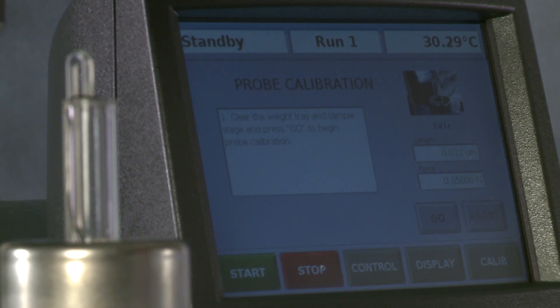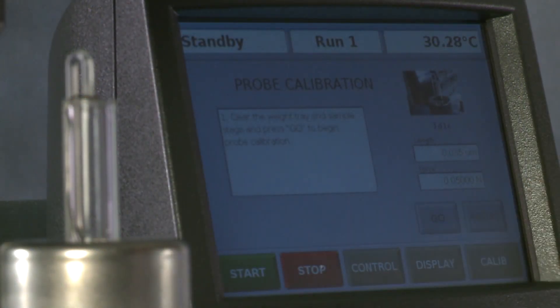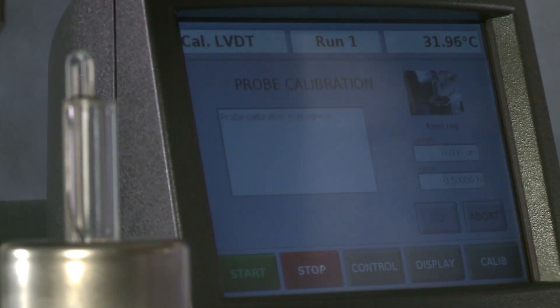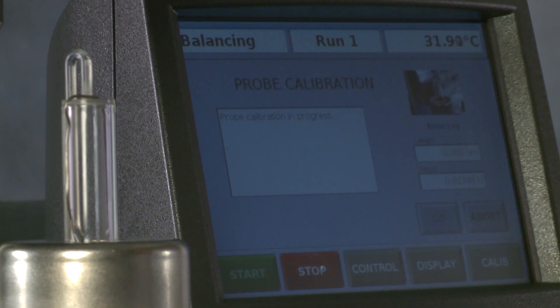We have a reminder to clear the weight tray if anything is in place. When it's ready, we push the go button. First, a zero will be made and probe calibration is in progress. Then the instrument calibrates the LVDT, which is a displacement measurement. Then the probe will move up and down inside the LVDT, as you can see now. This is the balancing part of the calibration process.